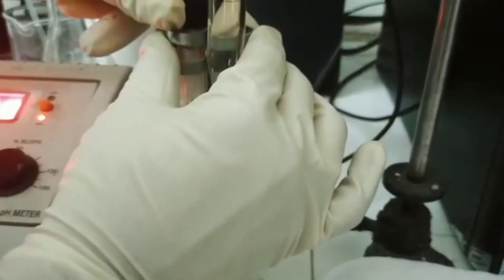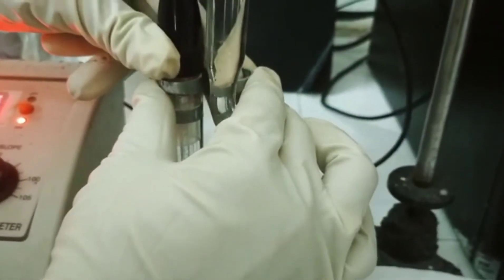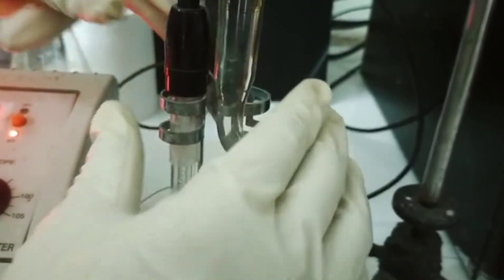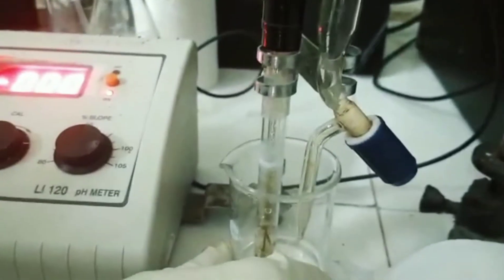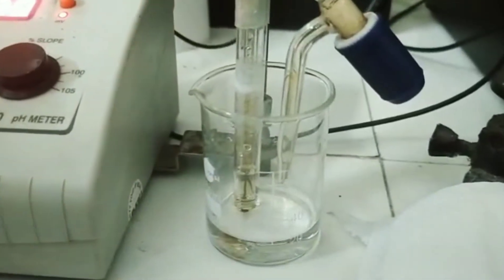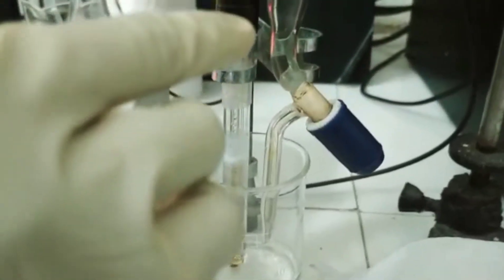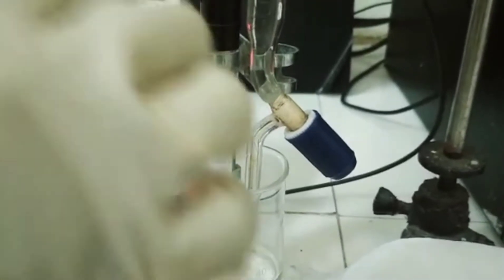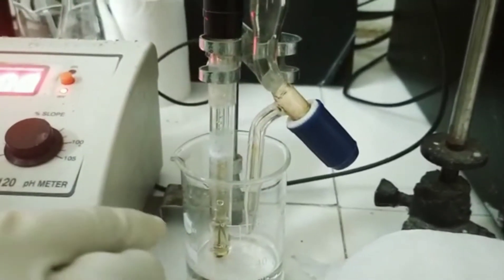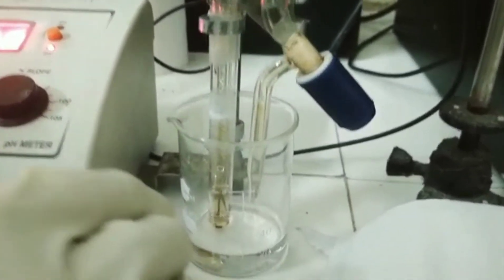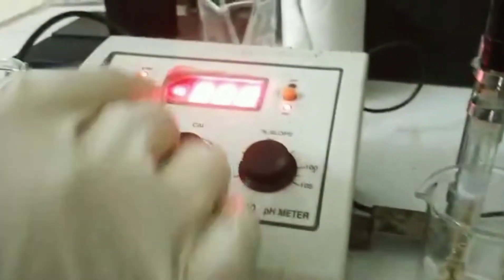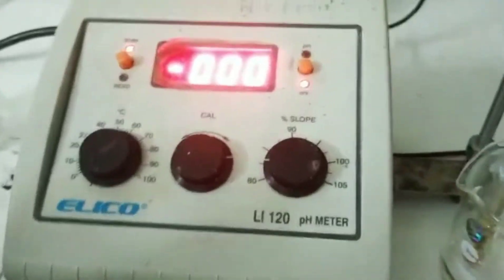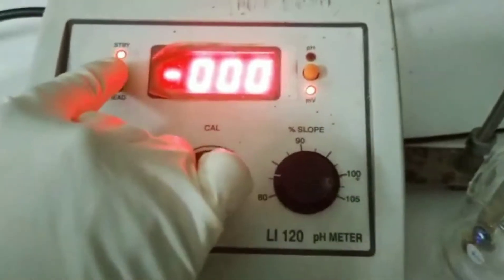So I am going to titrate the hydrochloric acid with sodium hydroxide solution by continuously adding this titrant 0.5 ml at a time and then stirring with a glass rod. And we will be observing the change in the potential. So I am going into the read mode.